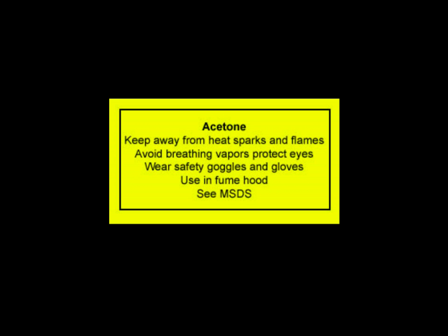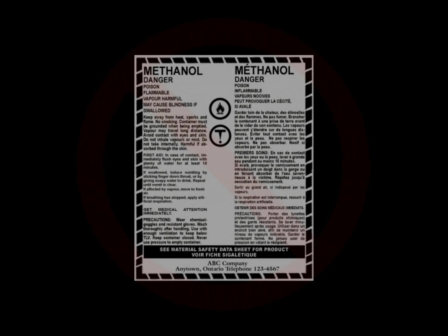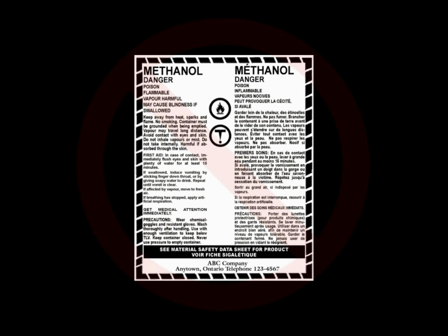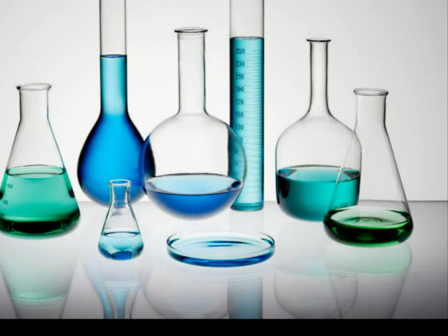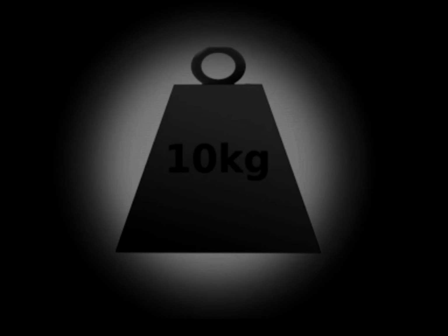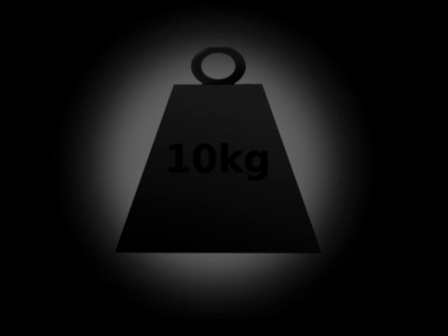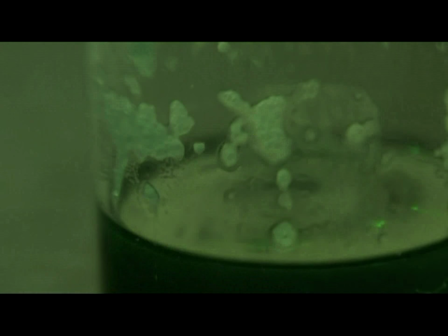Laboratory labels. The third type of label is the laboratory label. A controlled product that is intended for lab use only does not need a supplier label if it meets these conditions. 1. Comes from a lab supply house. 2. Weighs less than 10 kilograms. If you work in a laboratory setting, you will get job-specific applications of WHMIS guidelines.